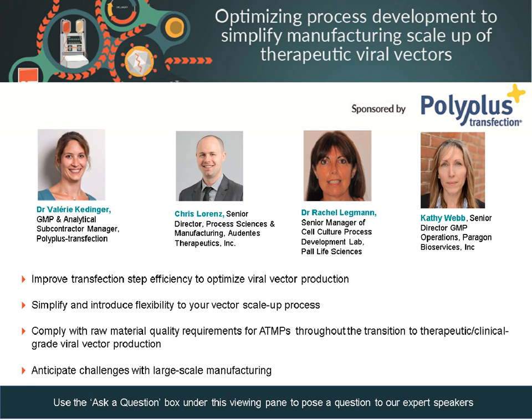will be discussing why virus vector production using the right transient transfection approach and combined cell culture system is absolutely crucial to achieve process performance whilst complying with quality requirements for process development and clinical grade manufacturing.